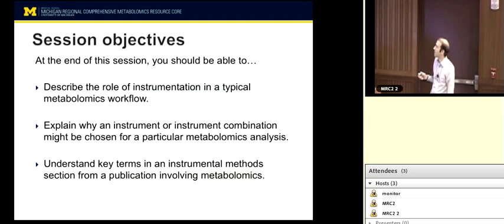When we talk about mass spec in the context of metabolomics, usually we're talking about LC-MS or GC-MS. We call this a hyphenated technique, where you have 2 instruments coupled together. Why would we want to do that? Steffi, who is very next, will talk about chromatography and metabolomics and why that's a logical combination, and a little bit more about this hyphenation. We will not talk about chromatography methods overview; that'll be covered by Steffi in the next talk.